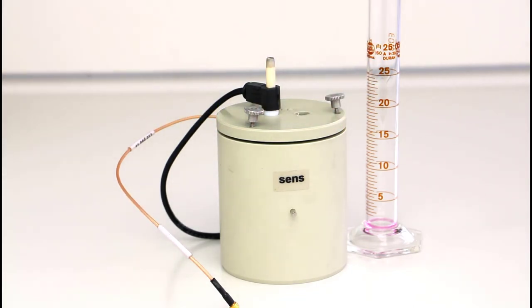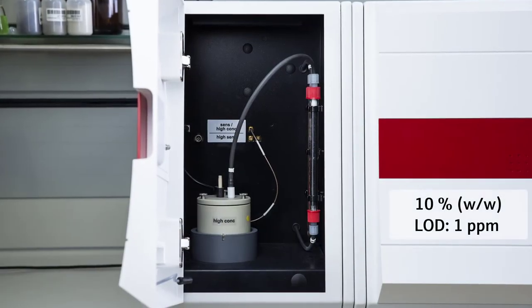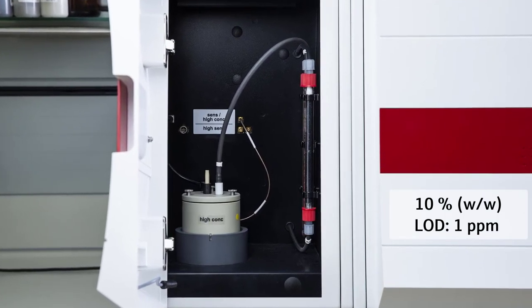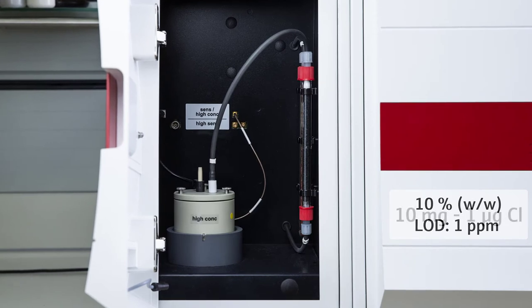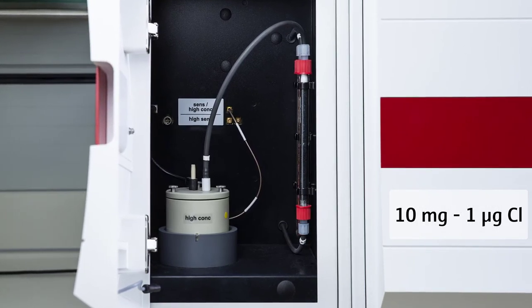In combination with the optional internal splitting, the upper limit is around 10 mass percent of chlorine, and the LOD is 1 ppm. All with respect to the specific mass. The absolute range is from 10 mg to 1 µg chlorine.